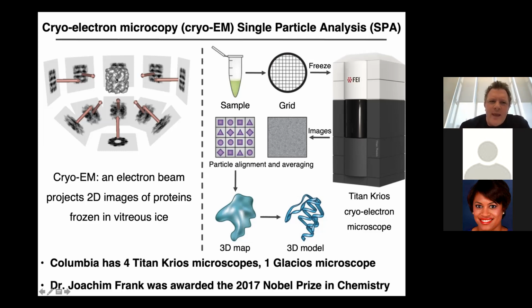And if we image this on a cryo-electron microscope shown here on the right, we actually can generate 2D projection views of this protein complex. And since the machine itself is viewed at different angles when it is being imaged, you can actually put together those 2-dimensional images, knowing the angles that they were taken at, into a high resolution 3-dimensional volume.